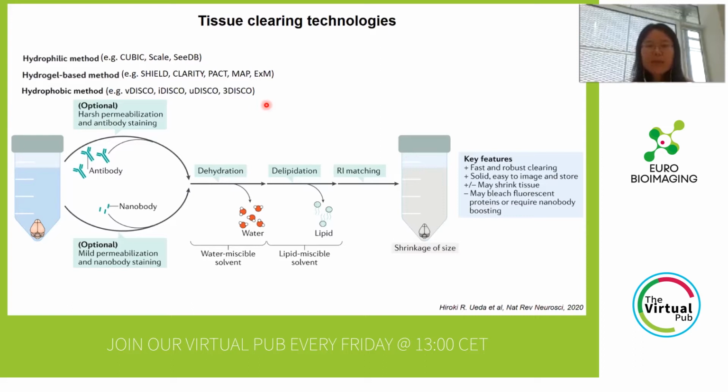Right now, most of the tissue is composed of cross-linked or fixed protein. Then we can put the tissue into a medium whose refractive index is the same as the cross-linked protein. Then, in the RI matching step, the tissue can become transparent.